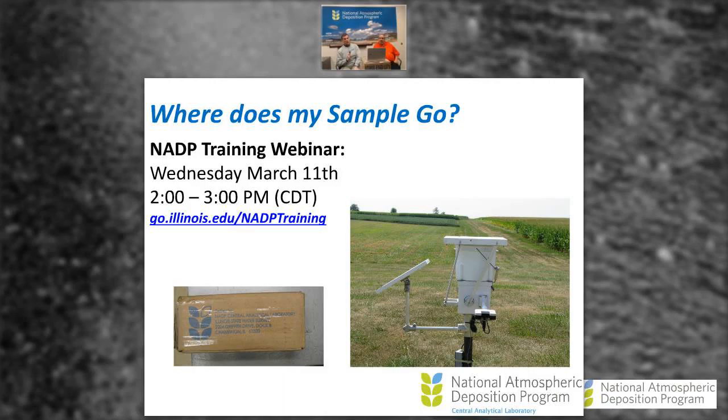The purpose of this webinar is this was one of our more popular topics when we would do on-site training courses here at the University of Illinois. Since we can't bring you to the lab, we're bringing the lab to you. We'll be going through the processes to prepare the supplies to go out to you, the sample receiving, and then showing you pictures of some of our staff and analytical facilities that we use to analyze your samples.